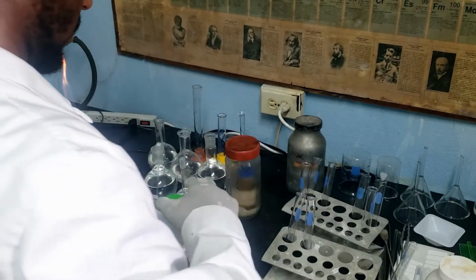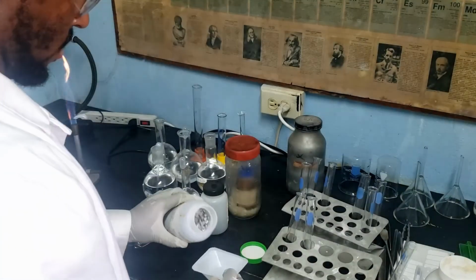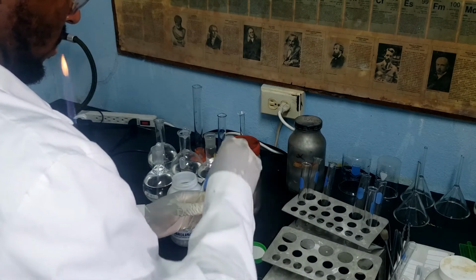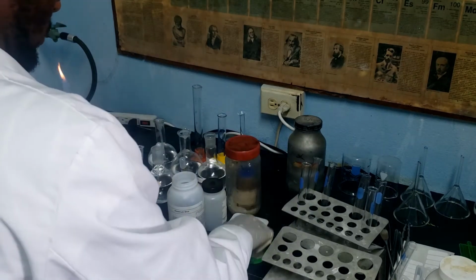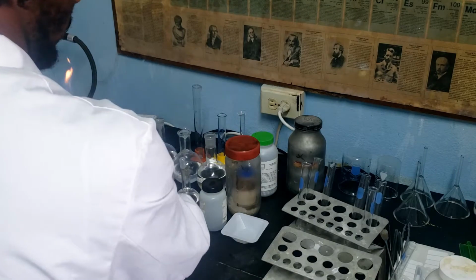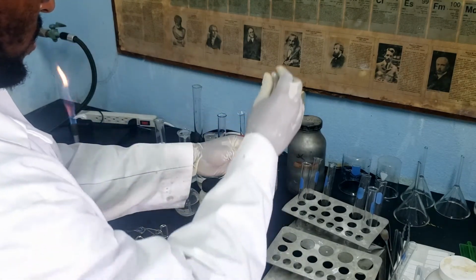In this next experiment, we compare what happens when we remove the oxide layer, previously protecting the aluminum from the hydrochloric acid. By heating 2 samples of aluminum shots with hydrochloric acid, the removal of the oxide layer is sped up.